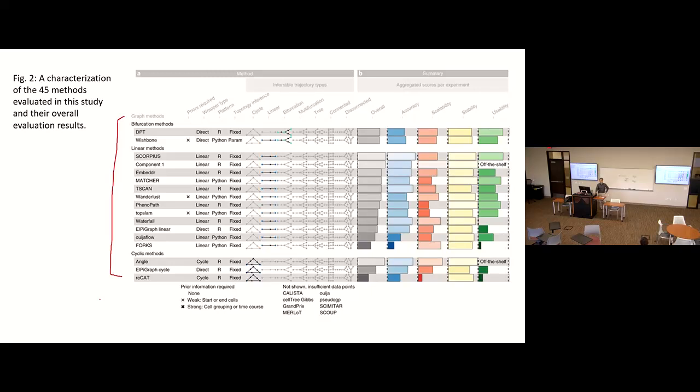They're probably not wrong, because these methods are all developed for trajectory analysis, but they will definitely give you different pseudo-time assignments for your cells. So I'll tell you what I'm going to use. We will do this Thursday in the computer session. I use FateID.